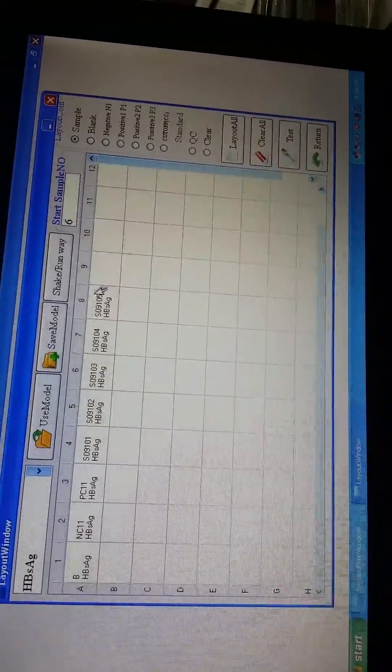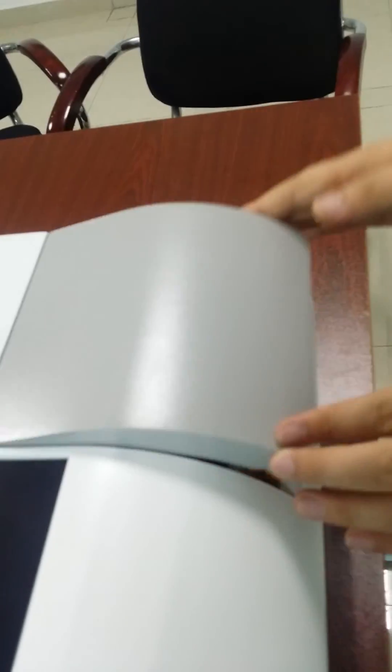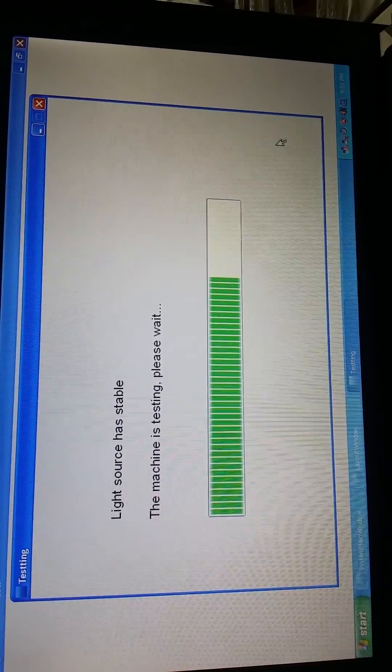After setting this, we should make sure that the blank regions match the software settings. After we put in the reagent and the sample in the cuvette, we place the blank here and cover it. After we do this, we press the Test button and wait 15 to 20 seconds — we will get the results.